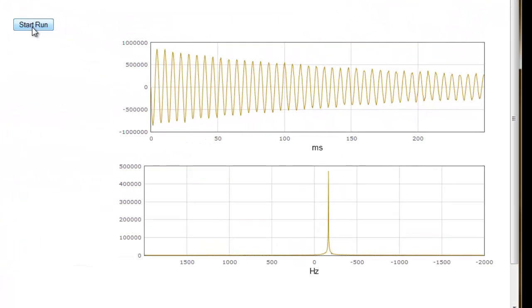You can see that when we zoom into a 4 kHz bandwidth, the signal which appeared to be on 0 Hz is slightly off resonance. Our signal is actually located at approximately minus 200 Hz. So that we can solidify our understanding of the process of adjusting the transmit frequency and its effect on signal position, let's make another adjustment to the transmit frequency.